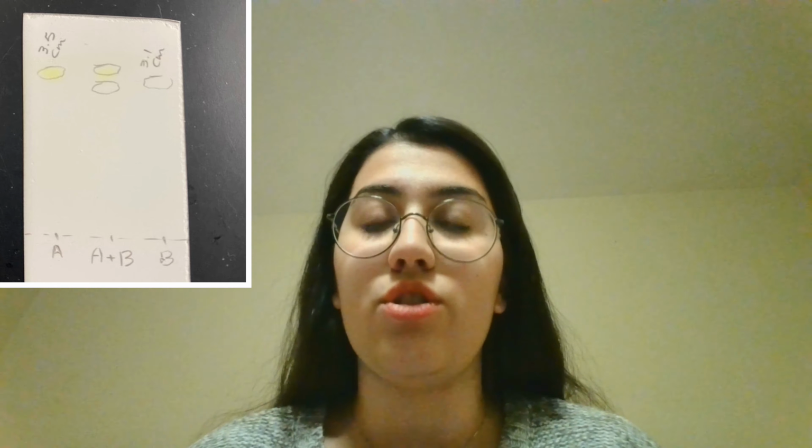In the first dot from the left, we can add our reactant, which is 2-naphthol, and on the right dot, we need to place our product, which is 2-butoxynaphthalene, and in the middle dot, we need to add a few drops of both of them, so it would be a mixture of both reactant and product. When placing the TLC inside our eluent, we see the liquid rising up on the TLC. It will also move the compound on each dot to the top.